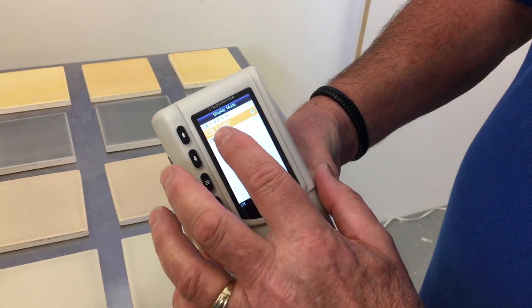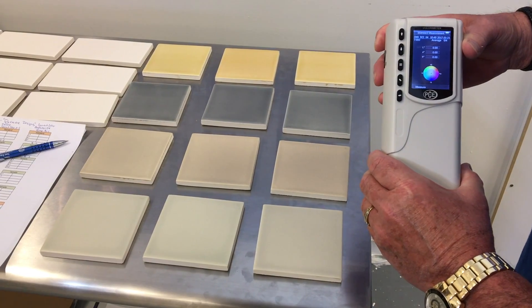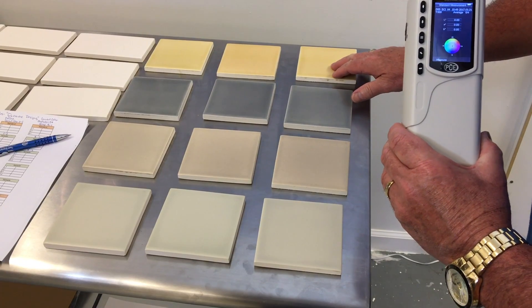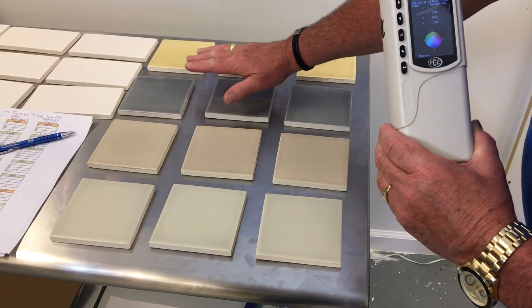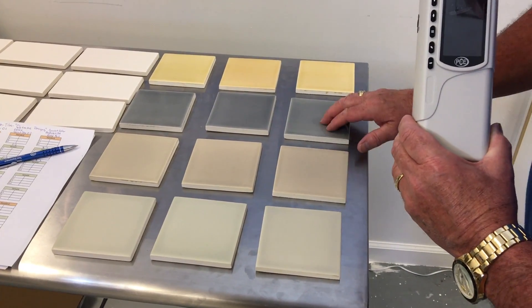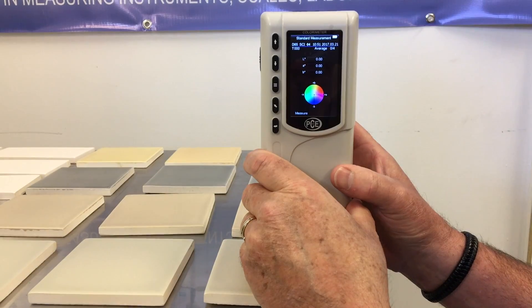Sample measurement — there they are. I pick this one: C-I-E-L-A-B. We are ready to start our sample measurement. We want all four of these tiles to be the standard for each of these colors. These are all going to be the samples and we'll find out if they pass or fail according to the color of these standard colors we're going to be setting up.